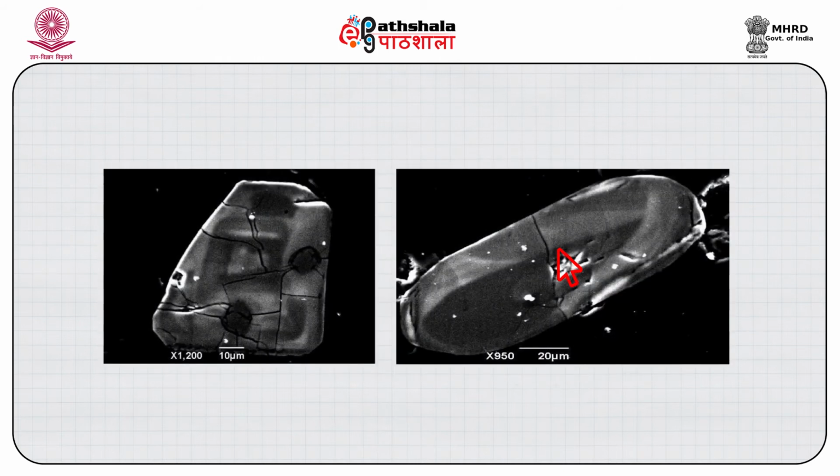Inelastic scattering also produces long wavelength radiation in the visible range as well as in the IR and UV range, and this spectrum produces very useful images of cathodoluminescence. Now, in these two figures, the cathodoluminescence images of zircon are seen, and one can distinguish different stages of growth in zircon as well as some included particles in zircon, and one can distinguish the magmatic and the metamorphic.